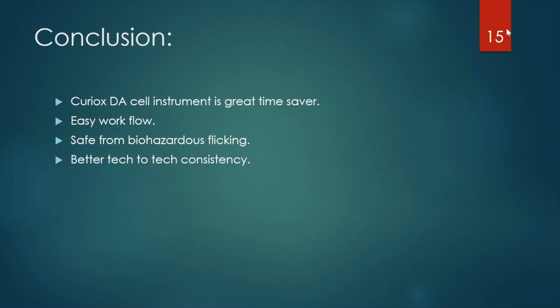Great. Next question: when adding staining antibody to the DA plate, do you mix by pipetting, or vortexing? The instrument comes with a vortex, and I did do vortexing. I placed my plate on that, and that wasn't sufficient for my mixing. I had to mix with a pipette. I did mix it with a pipette, and after that, I vortexed it. That is fine, but just vortex is not sufficient enough.